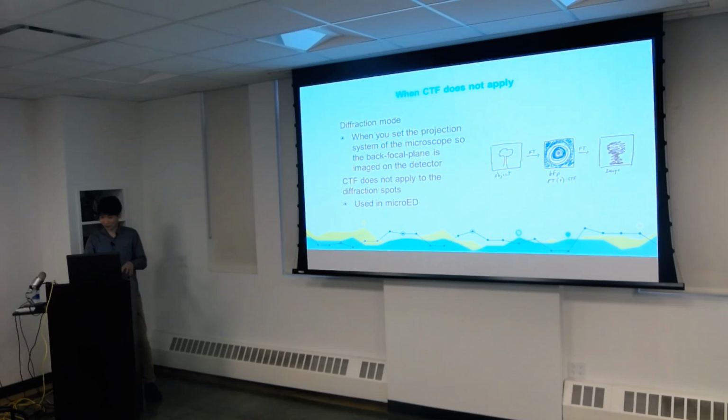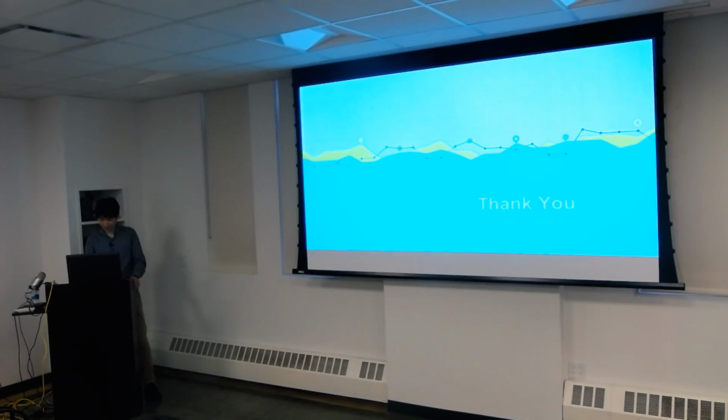The CTF is defined as: the back focal plane Fourier transform multiplied by the CTF, and you get the image. So what happens here is that the CTF doesn't apply to the diffraction spots, so you don't have to worry about all the issues of the CTF if you are doing something like micro-ED. Okay, thank you. And now we move on to Anchi.